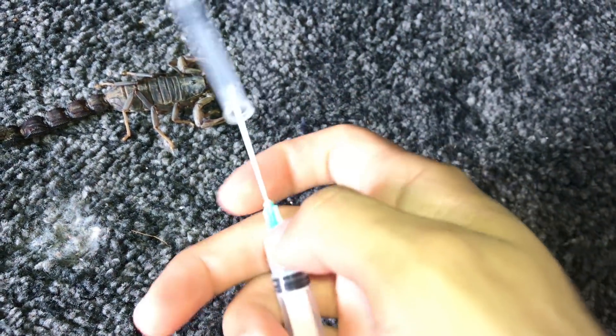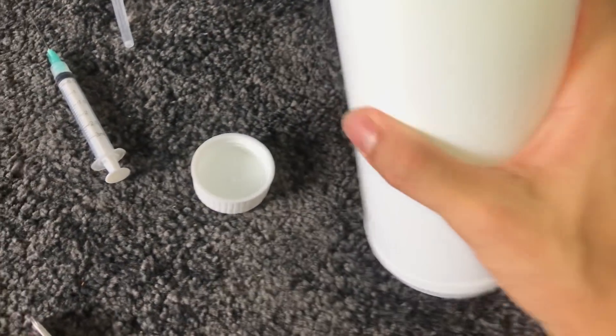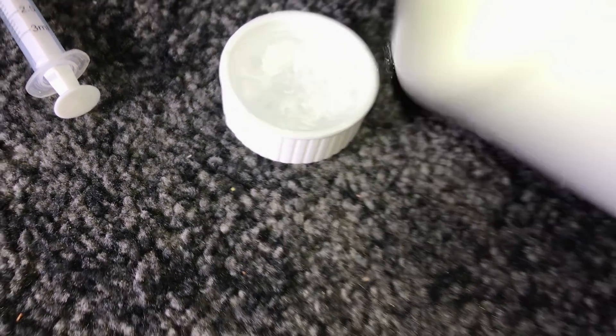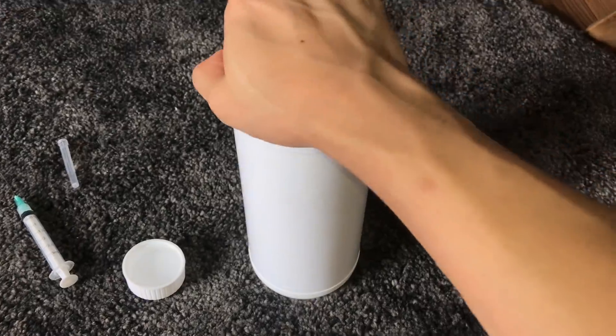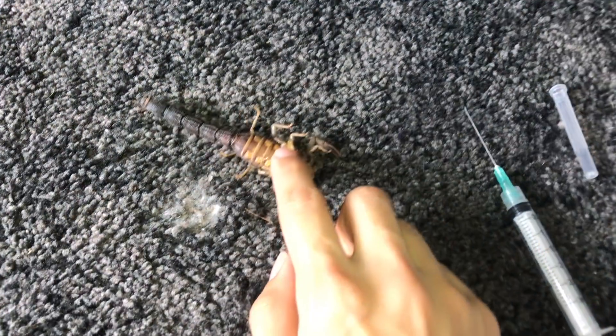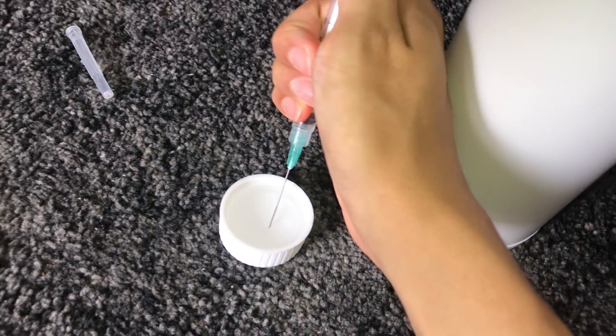We're going to be using some isopropyl alcohol. I'm unable to obtain proper preserving alcohols, but this seems to work — I have a lot of preserved specimens and they don't seem to rot or get destroyed. Let me put some alcohol in... whoops, a little too much. I'll suck it up into the needle — the sun is coming out and the brightness just increased.